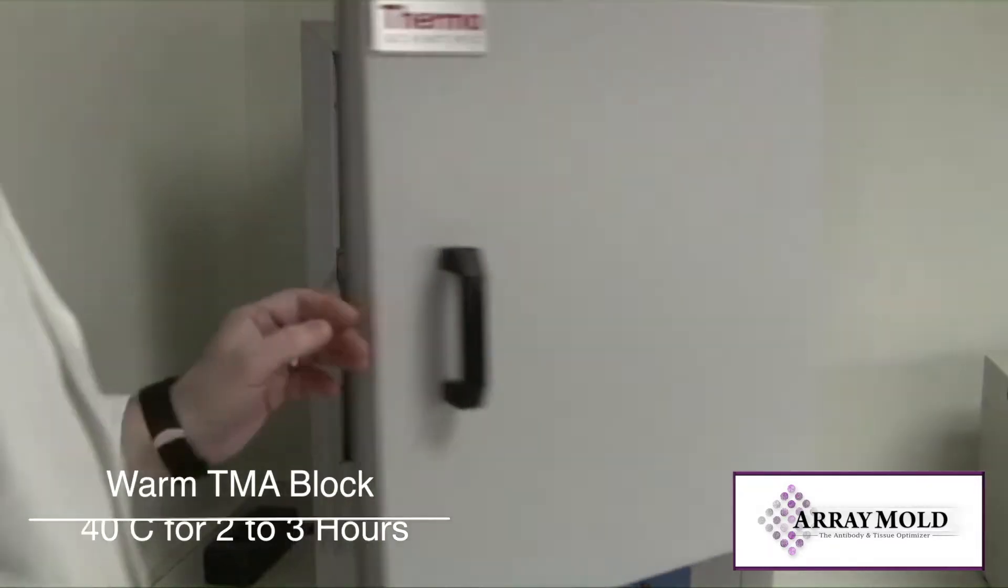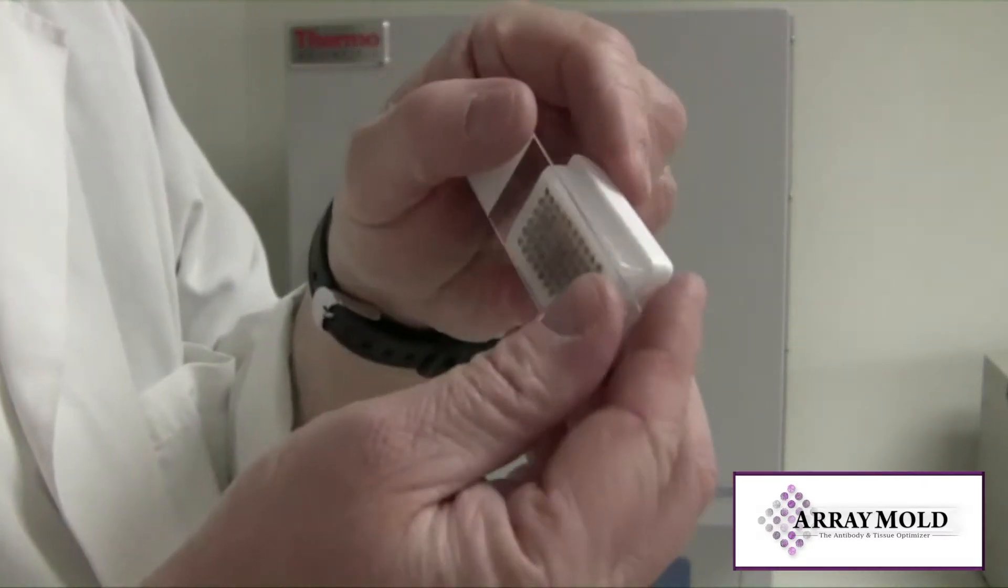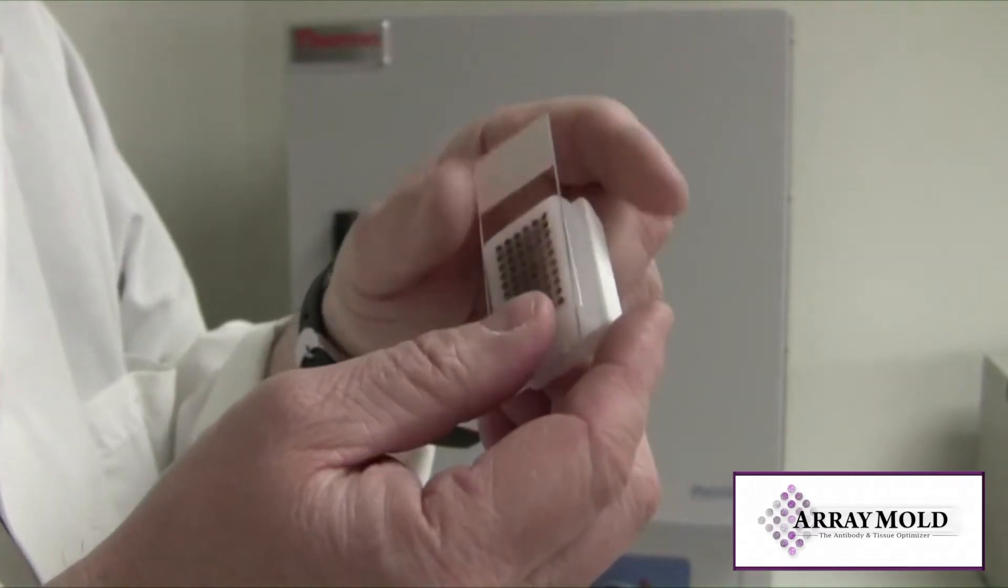Now you'll need to remove the paraffin block and slide from the oven, but don't separate them yet. You will need to heat up another slide around 70 to 80 degrees Celsius by itself. I'll explain why in a moment.